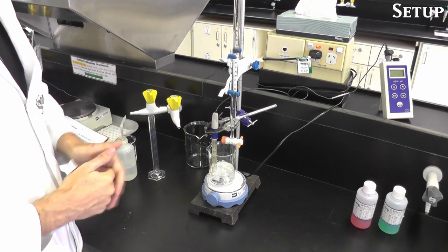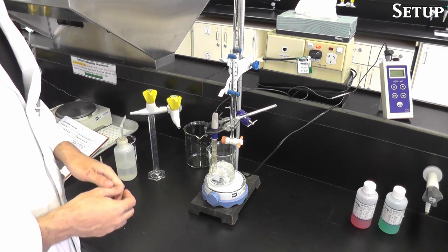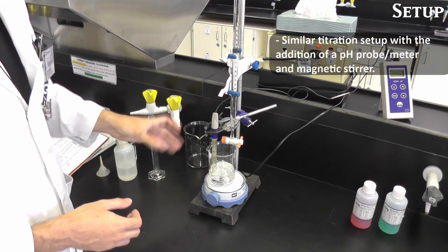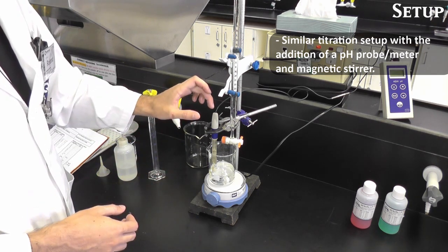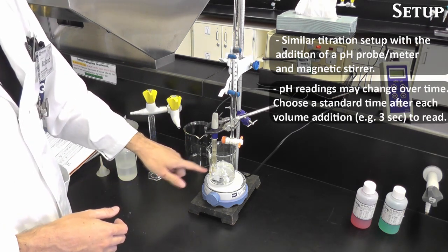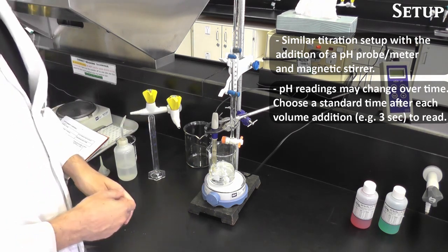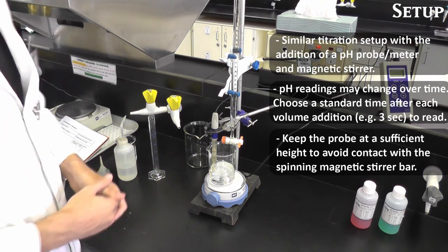A quick forward about the setup of a potentiometric titration. It differs slightly from our colorimetric titration because we use a beaker instead of a conical flask for a couple of reasons. One is we're not swirling by hand anymore, so we don't have to worry about spills too much. And the second is we need to accommodate for our pH probe to sit in the solution as well. So the tip of the probe needs to be completely immersed by liquid. That's why we have inside the beaker both 25 mLs of our acid solution and 75 mLs of water to make sure the tip of the probe is covered.